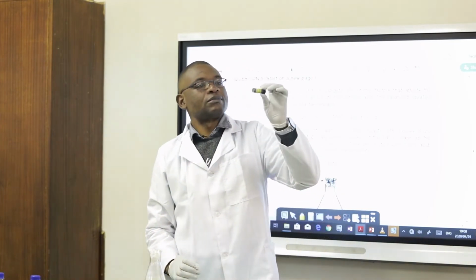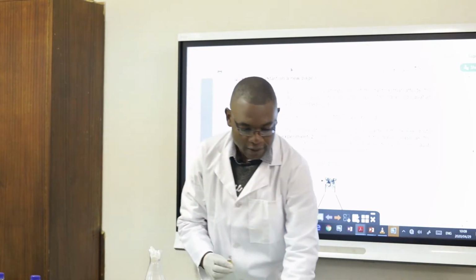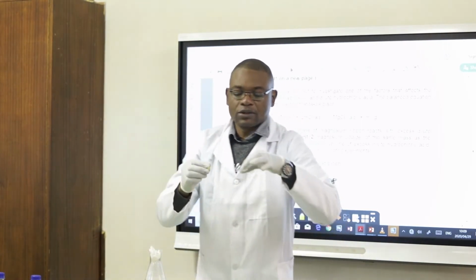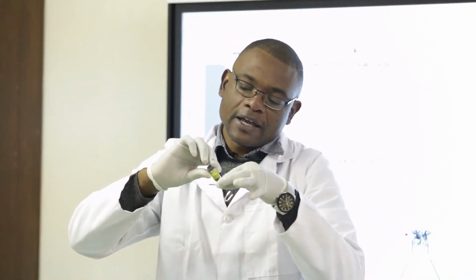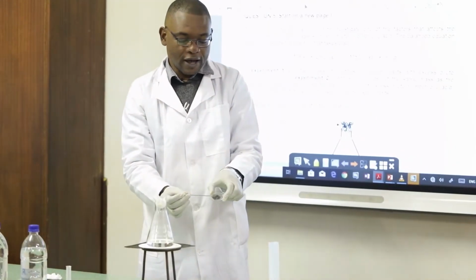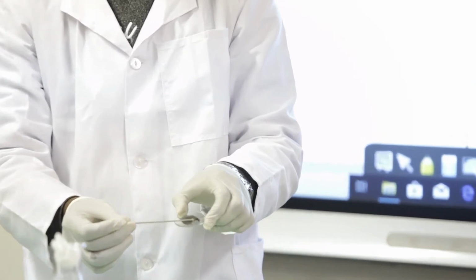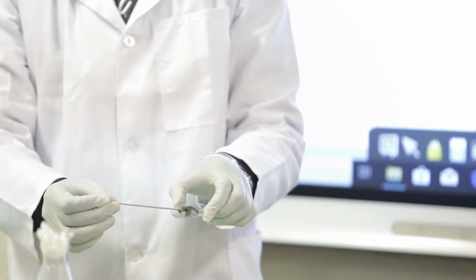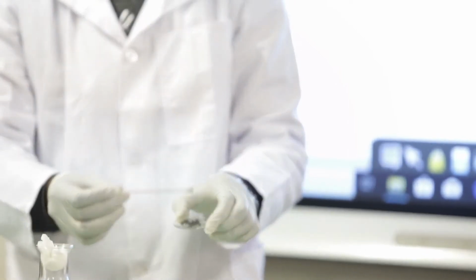So yes, this is fine magnesium powder. Let me put it here so that you can actually see how fine it looks. It's very fine powder which is finely ground, and it's a metallic gray in color, as you can see.